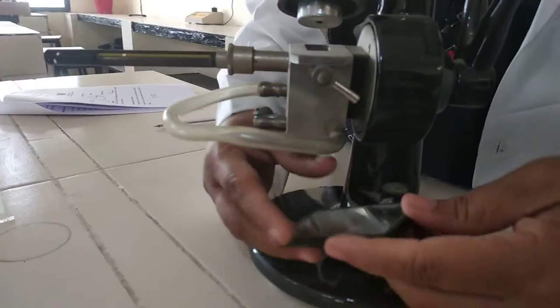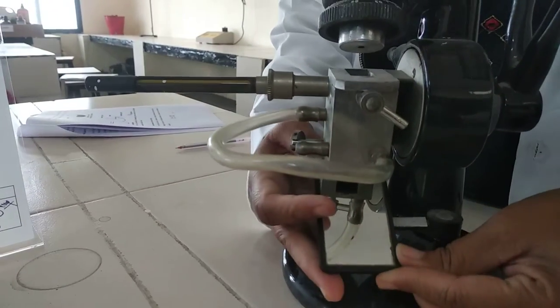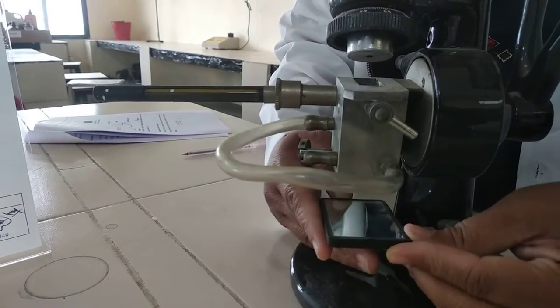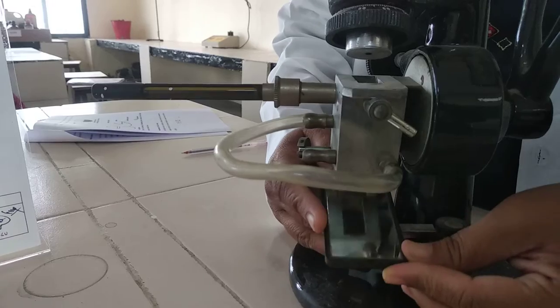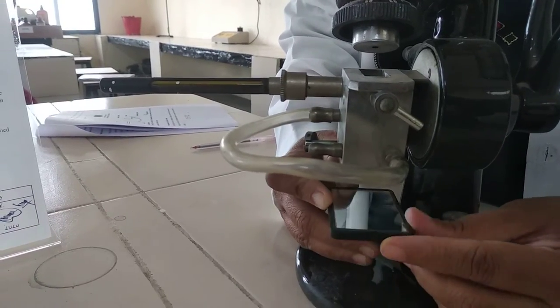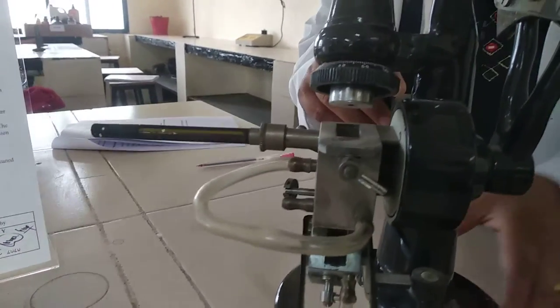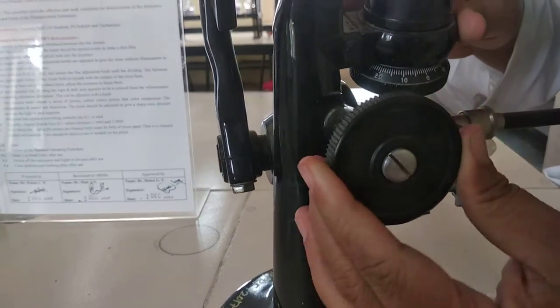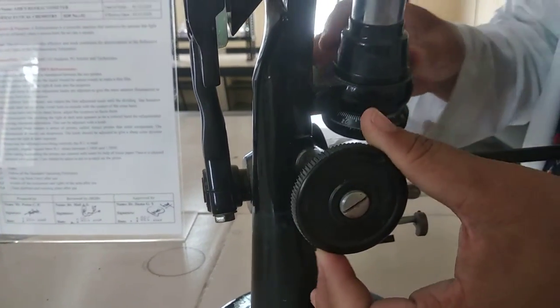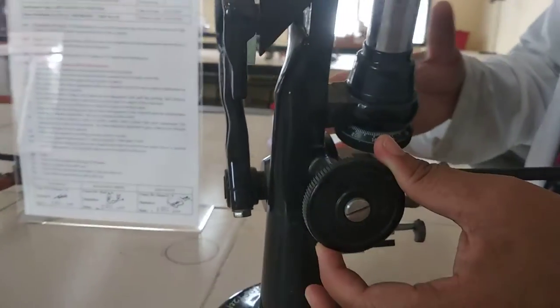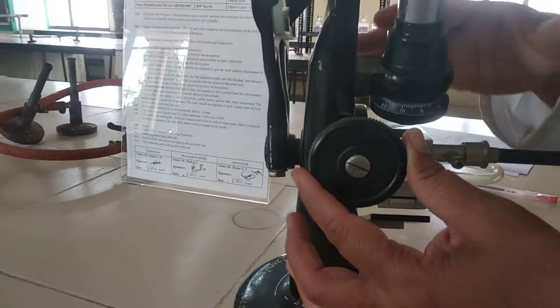Second one, this one is a mirror. The mirror is used to focus the light. Then it contains one knob, an adjusting knob, to adjust our reading or to focus the sample for adjusting the reading.